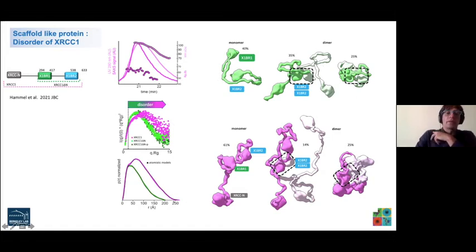The PRR function at 250 angstrom tells you that it's probably elongated, and indeed partially unfolded, as you see in the Kratky plot. So the combination of those two pieces of information, the P(r) and the Kratky plot, can tell you, and then you also have the moles here that tell you, oh, you have a monomer-dimer mixture. Oh, it's very elongated. Oh, it's disordered. Bang, you're done.